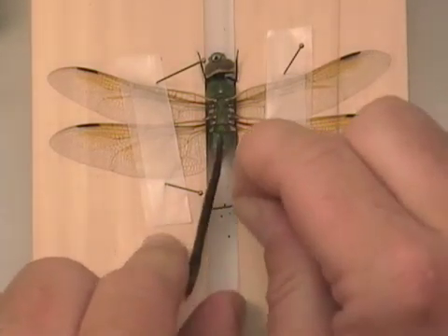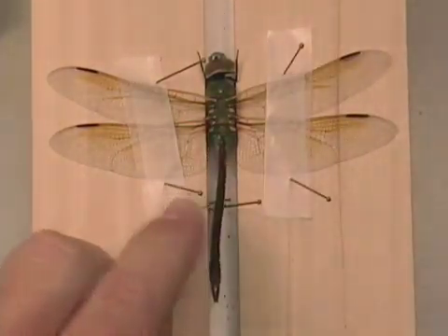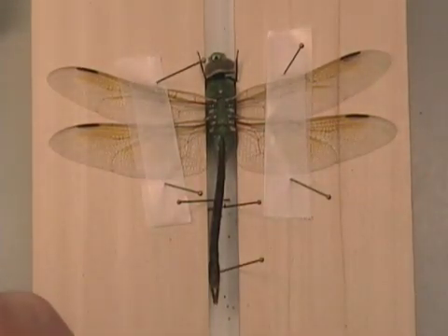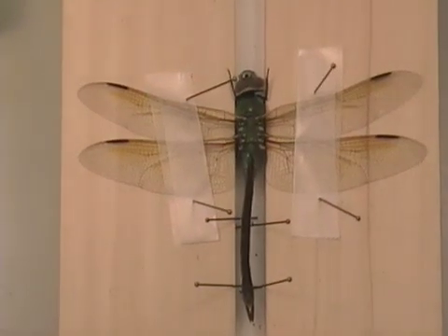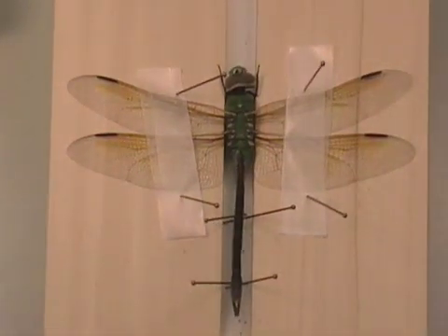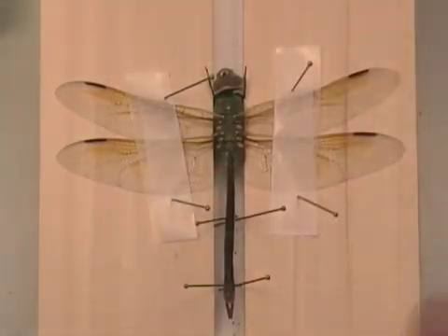Dragonfly abdomens are long and difficult to get to stay up, so you may have to prop them up with several different pins in several different places to prevent them from sagging. This one's got a nice little bend to it. So now we have the dragonfly flat, with the leading edge of the hind wings perpendicular to the axis of the body.